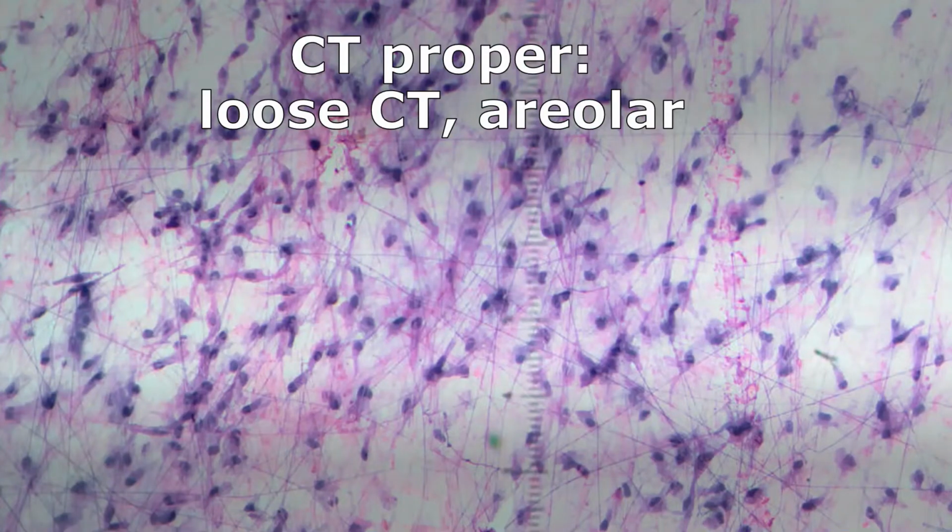Less better image, but still I see the collagen fibers, the pink things in the background. I see the black snake elastins. I see the fibroblasts. The point is, can you see those now that you've seen 3 different images of this?